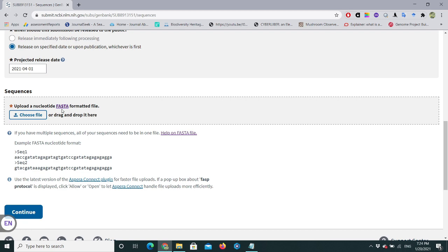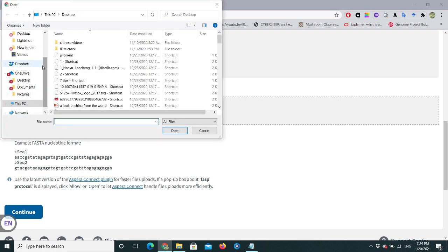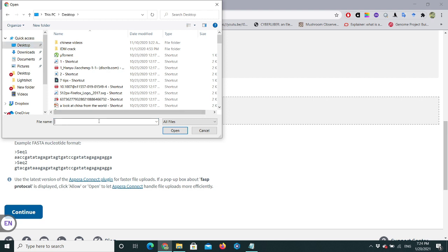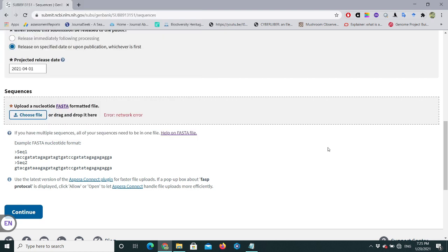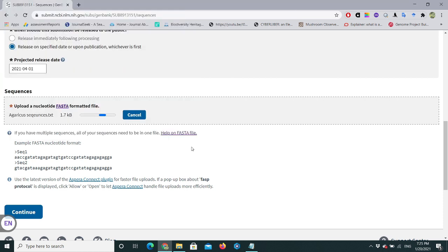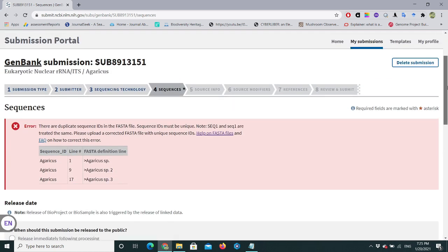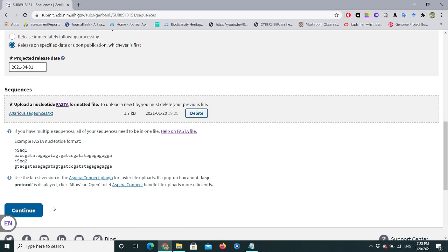Delete the old file, choose the corrected FASTA file again, and proceed to the next step. Let's hope this shows no errors now. Continue.